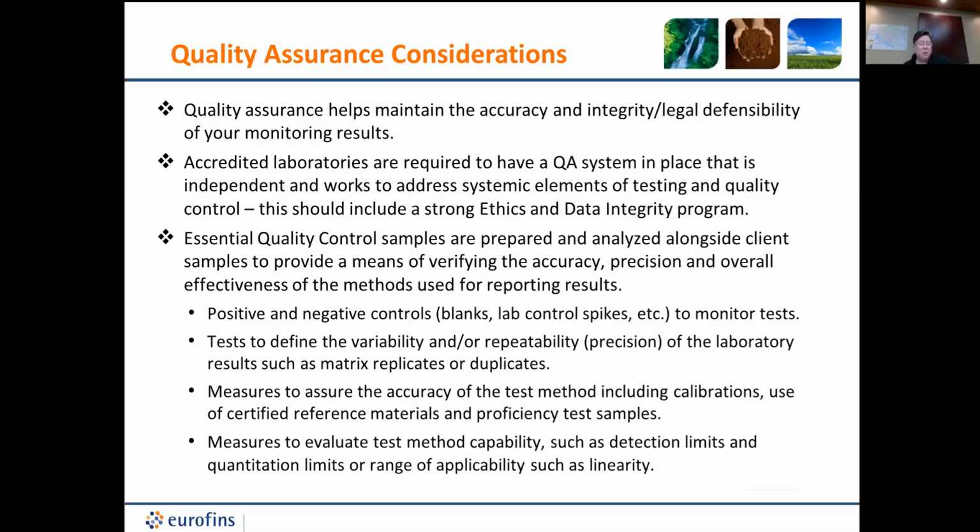You know, is calibrating a pH meter. It's no different than tuning up your car. You want to make sure it's running optimally so that the stuff coming out of the tailpipe, the positive and negative controls, and the precision data is as accurate as it can be. And that we're evaluating test method capabilities so we understand what detection limits you're going to need, what's your quantitation limit, you know, that we have all of this in place. And all of the accredited labs that are under NELAC or even California ELAP should have QC like this in place. That shouldn't be a question.